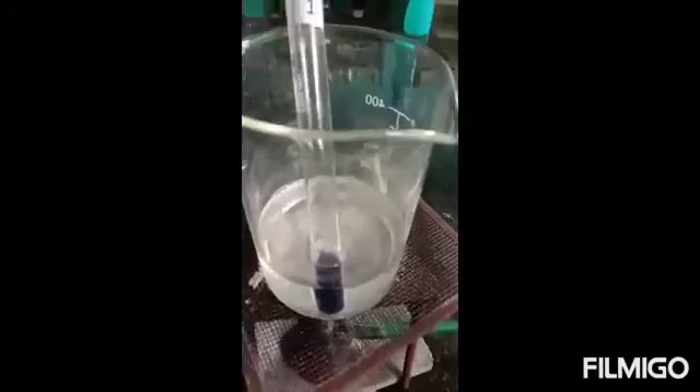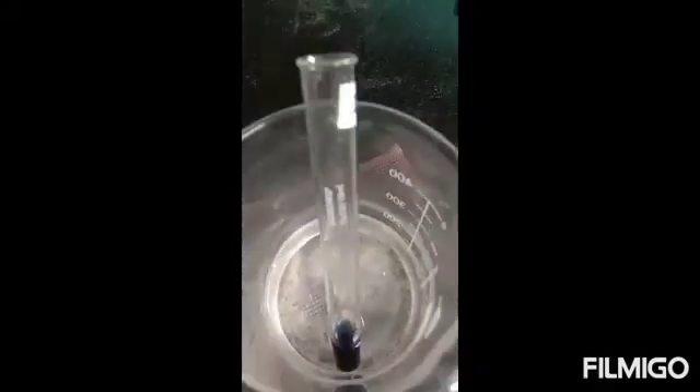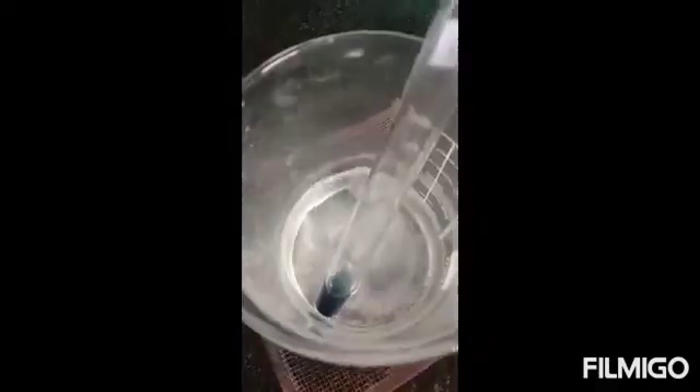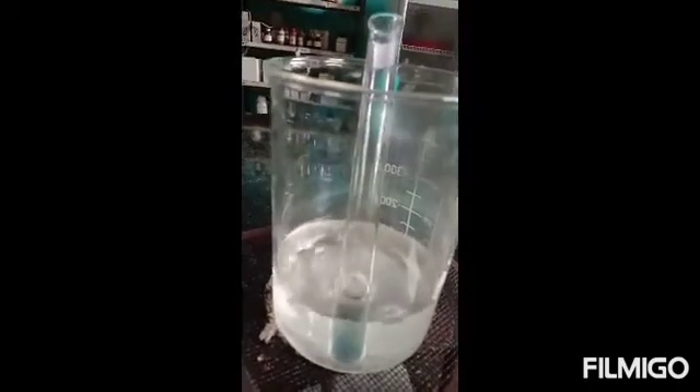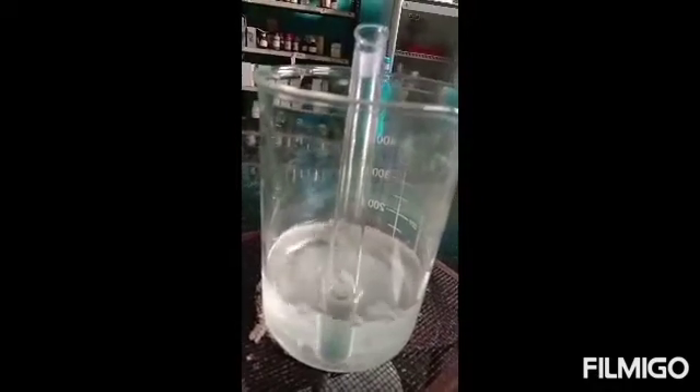Now the positive test tube in which starch was taken is placed in a boiling water bath. It is kept there for one to two minutes, and in the boiling water bath it starts to lose its color. After one to two minutes, the color is almost completely cleared.